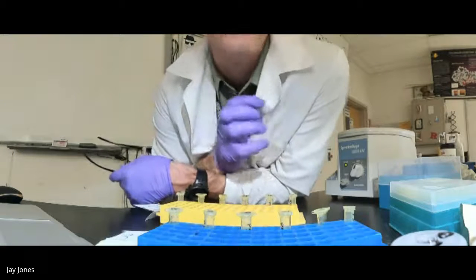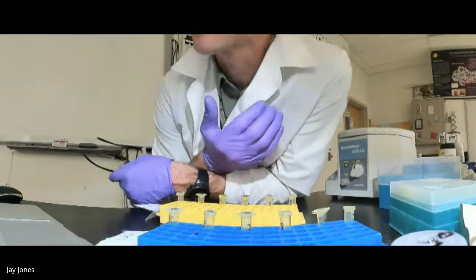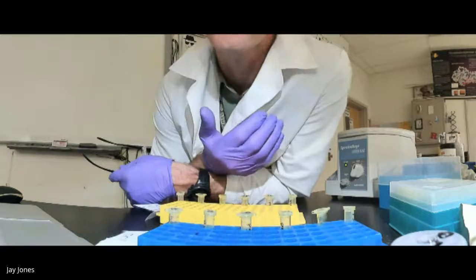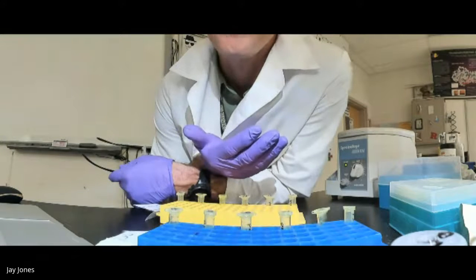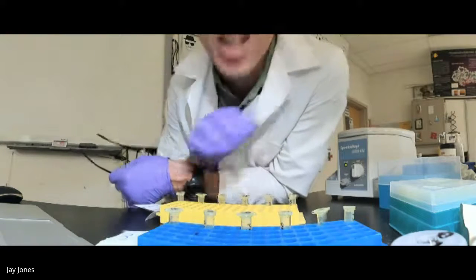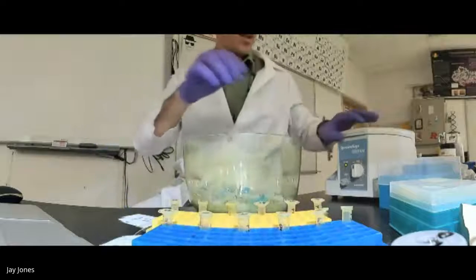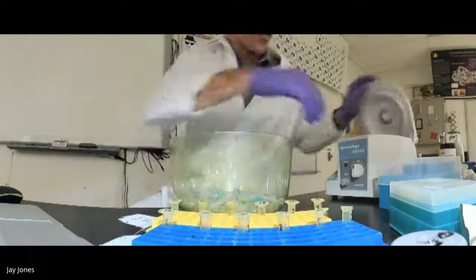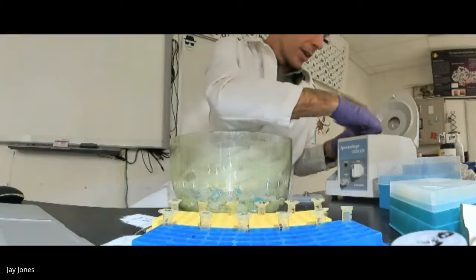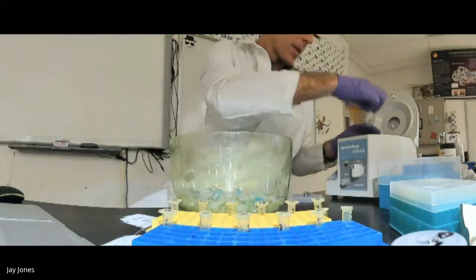So the column's grabbing the plasmid DNA and holding it tightly. The ethanol is dissolving everything else from the column except for the plasmid DNA. The plasmid DNA is stuck to the column. We're washing off the other stuff. Let's see if it worked. I don't know for sure if it worked, but I can infer from what I see here. So this step is interesting. I'm going to start with table 12. I'm going to work right to left.